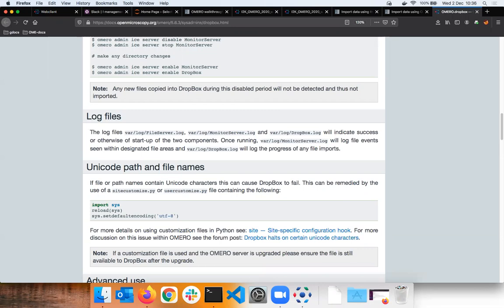And by the way, I think the cron job is named after Kronos, the god of time. This is because this small piece of software is simply timed. It will start at 2 a.m. in the morning when everybody sleeps. It just measures time and says, that's my time to start now, I will do the job. And this is not a human intervention. That's what is called a cron job, so that you are not confused by that.